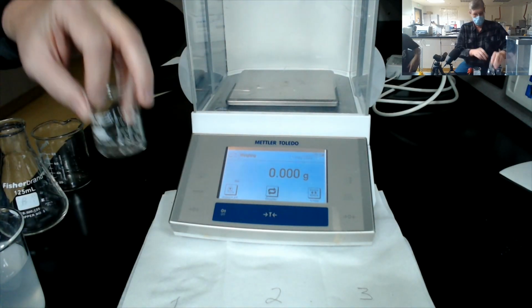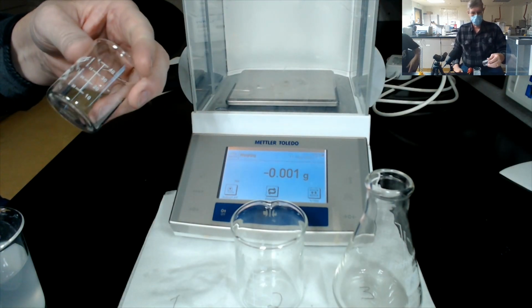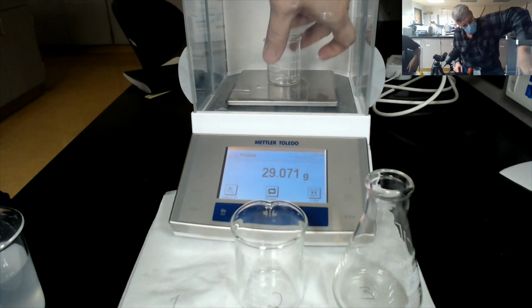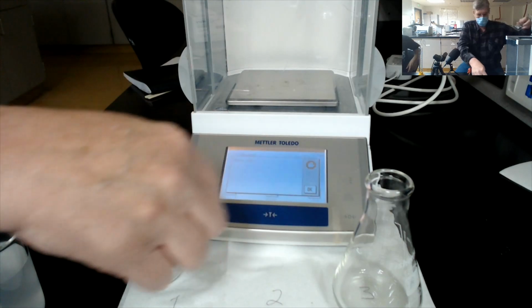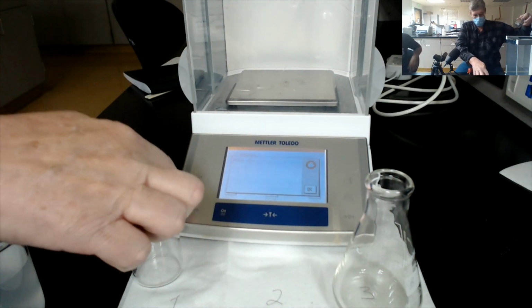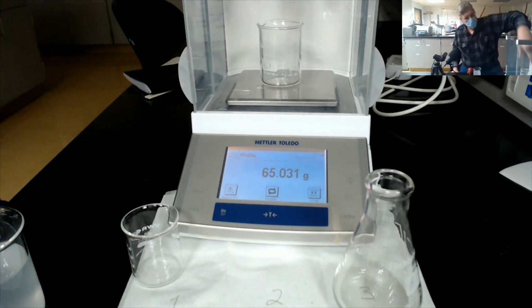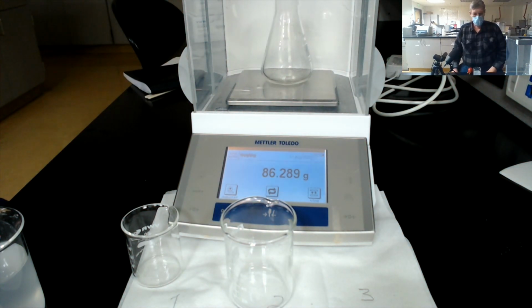So we just have to weigh the containers, and I made them all look different, and record their initial mass before we add the 20.00 milliliters of the unknown liquid. So first, mass number 1. Okay, record mass number 1 in your notebook. Then mass number 2. Record that in your notebook. And then mass number 3. Record that mass in your notebook.